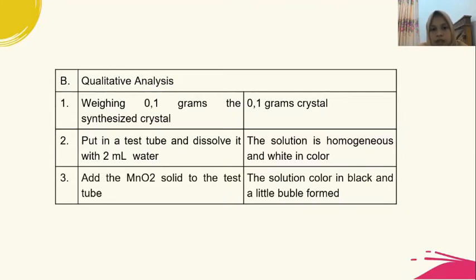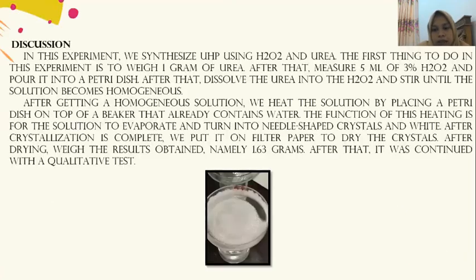Qualitative analysis: weigh 0.1 grams of the synthesized crystal, put it in a test tube and dissolve it with 2 milliliters of water. The solution is homogeneous and white in color. Add solid MnO2 to the test tube. The solution turns black and a few bubbles form.